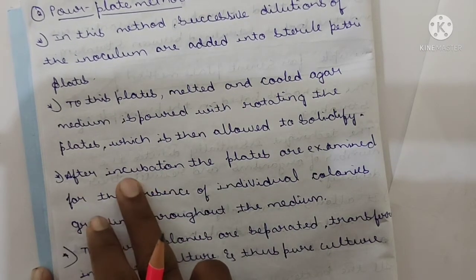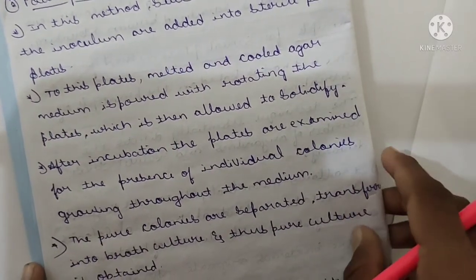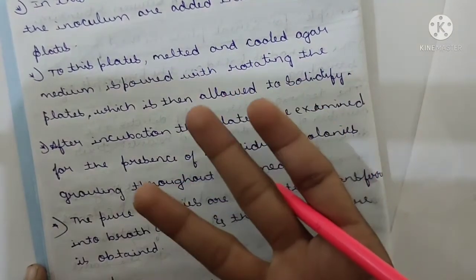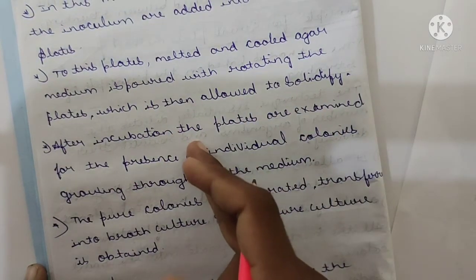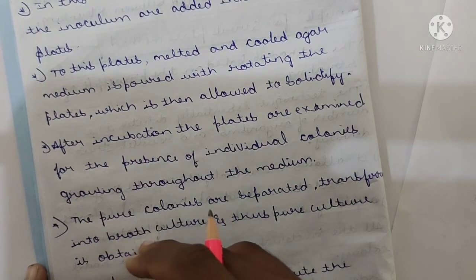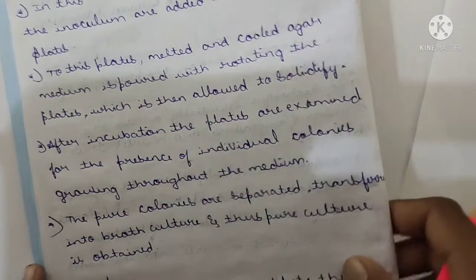After incubation, the plates are examined for the presence of individual colonies growing throughout the medium. After incubation of the petri dish agar plates, where we incubate different types of mixed organisms, we can easily study the individual colonies growing throughout that medium. Which type of colony is growing, what are their characteristics, we can study that.